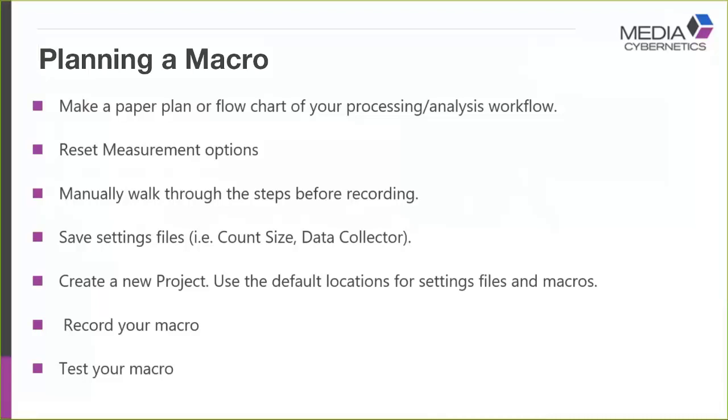And editing, again, it's one of those features in the macro editing capability within Image Pro. So once you create the new project, you can then start recording your macro, and then always test your macro, walk through it, rerun it, make sure everything's behaving the way it should. So that's just general steps for writing the macro.